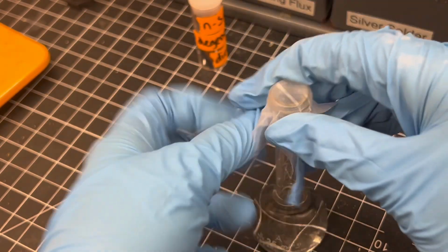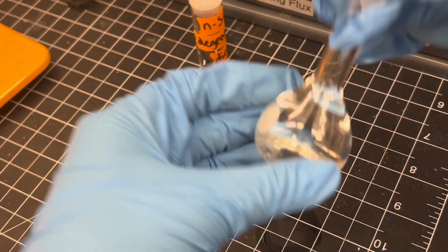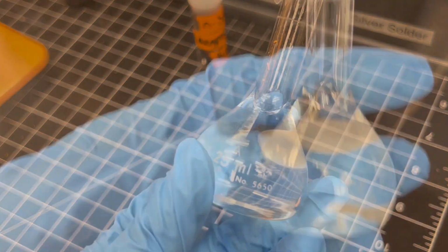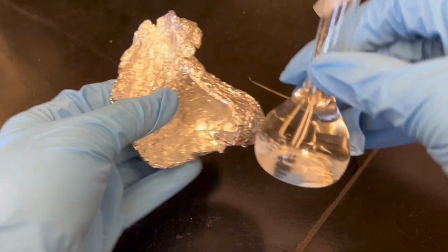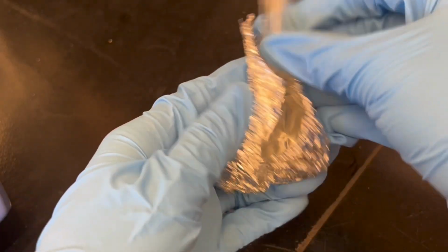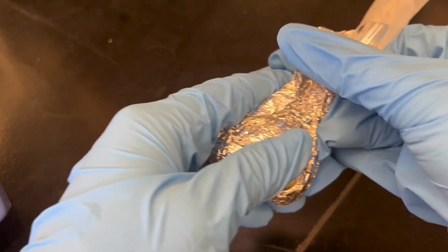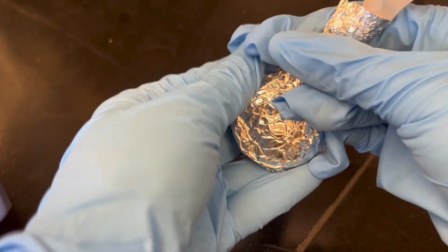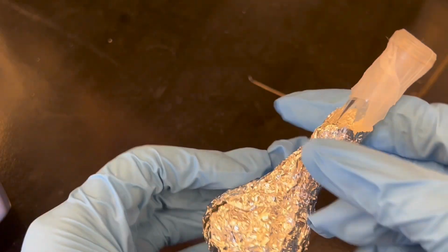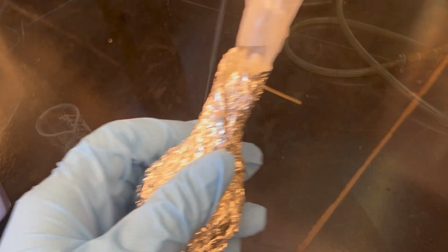Now I'm parafilming it, but you could parafilm it earlier. But make sure it is parafilmed during degas. And I also use some foil to avoid the light, because the solution is a little bit light sensitive, so make sure to foil it well.